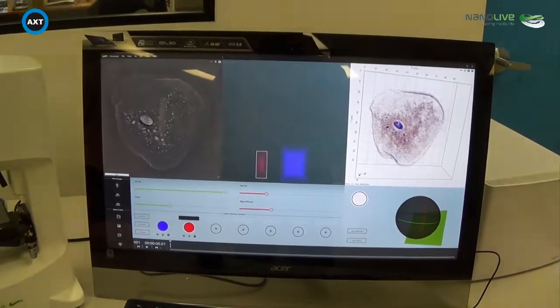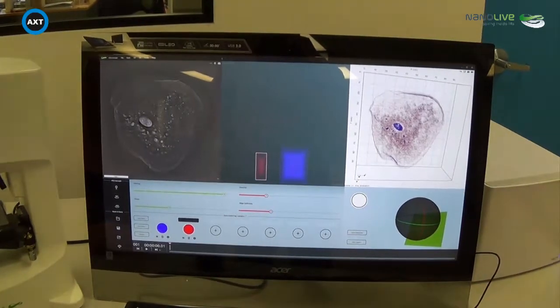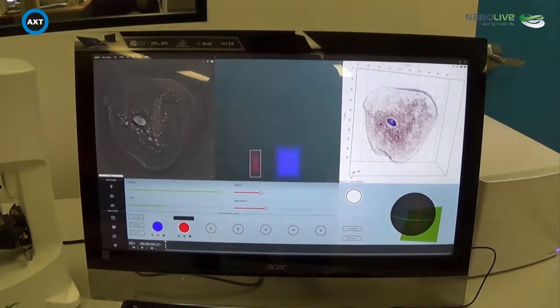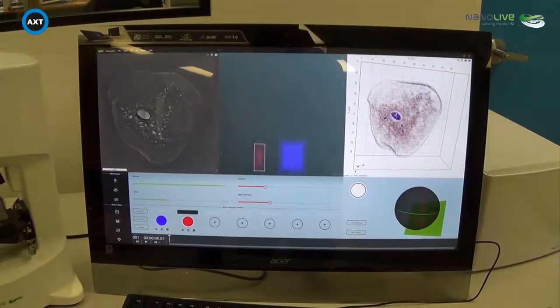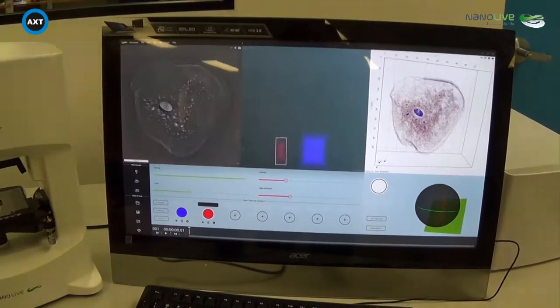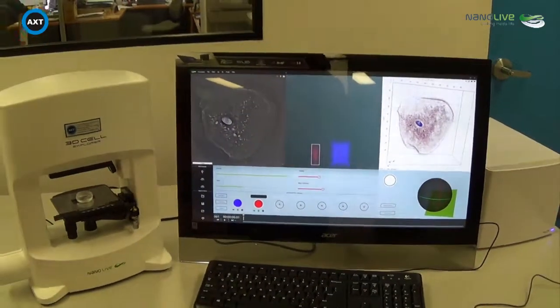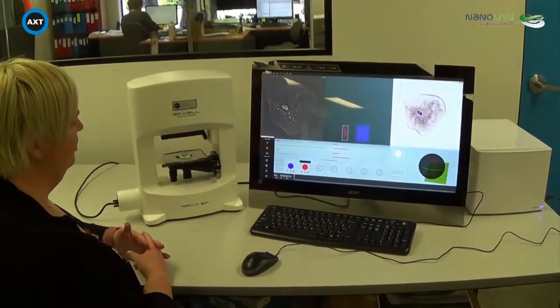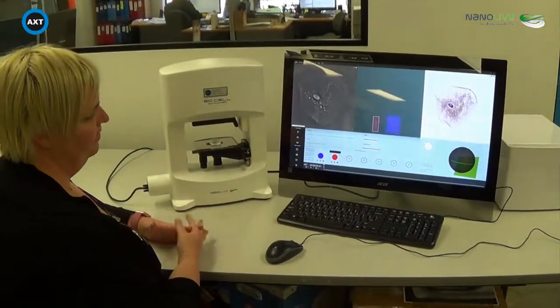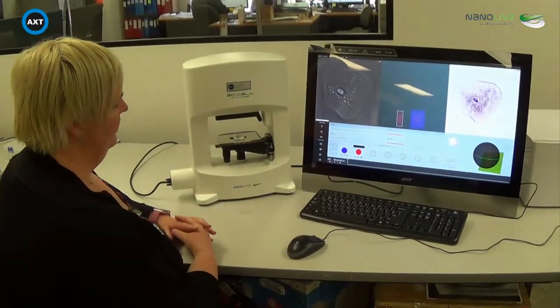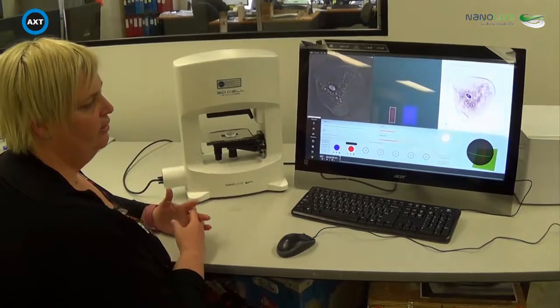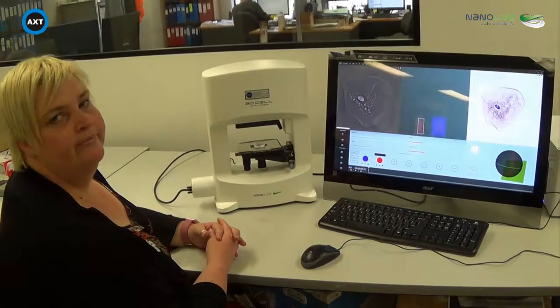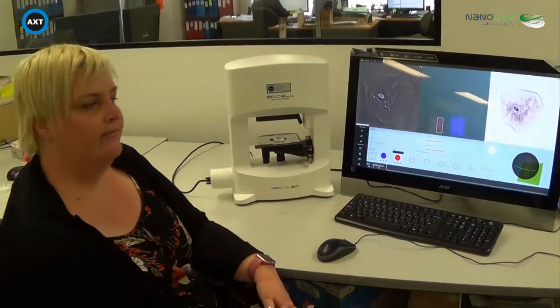So it's very quick to be able to capture an image or a set of images for a sample? Yeah, so the first time you use a dish on the microscope, it will have to do a calibration just to align the mirrors so that the amount of light getting through the sample is enough to illuminate your sample and get an image. And that process can take 2 to 3 minutes, but once that's done, every image taken within that dish will be about 3 or 4 seconds.